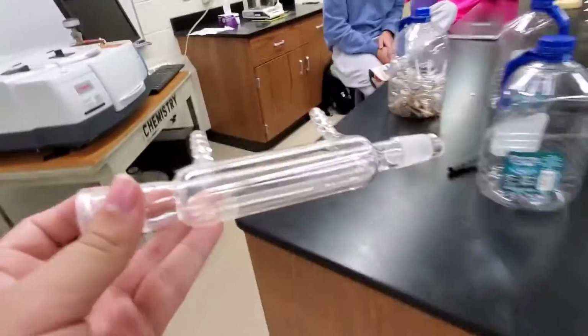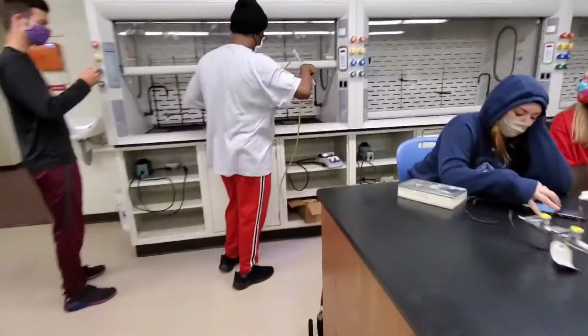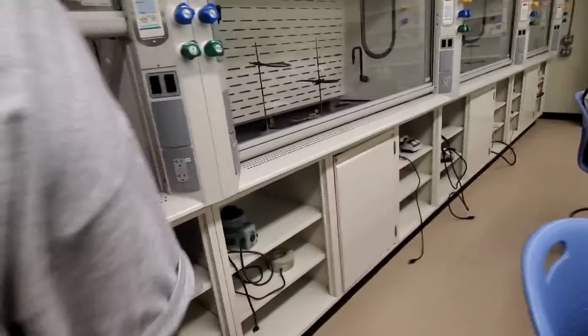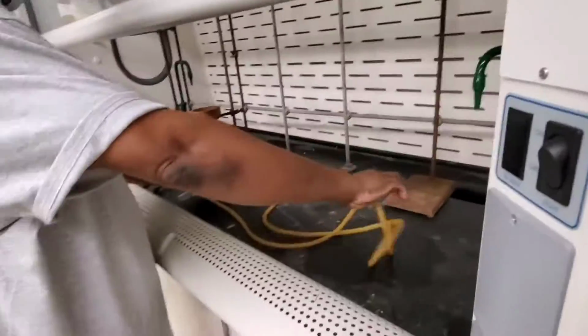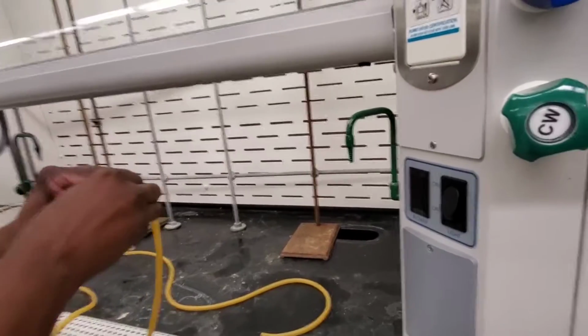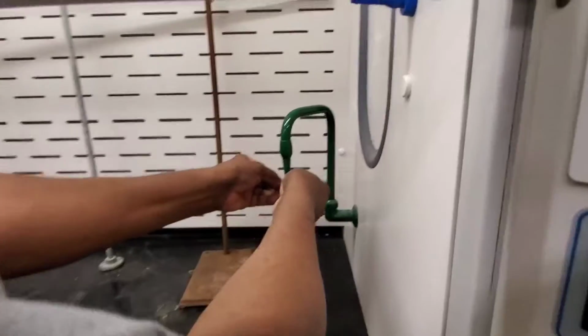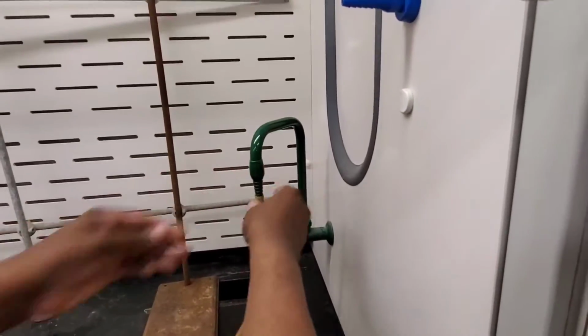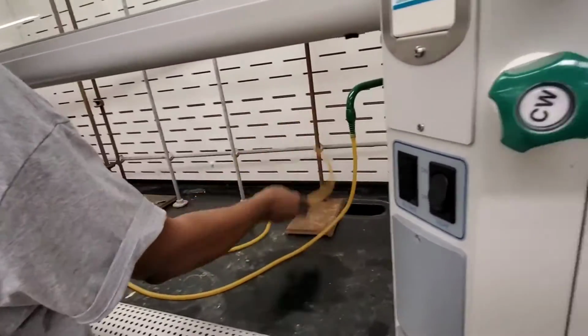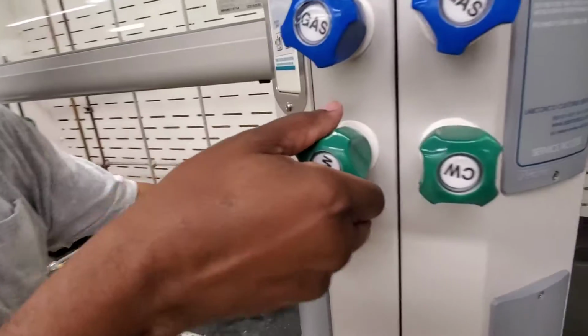So we go back here to show you how, because you'll be setting up in the hood. Okay? But before you put the condenser onto the round bottom flask, let's turn the light on. We connect, this is the water taps here. So there it is, it's connected. Now we're going to have the water flowing here, cold water.